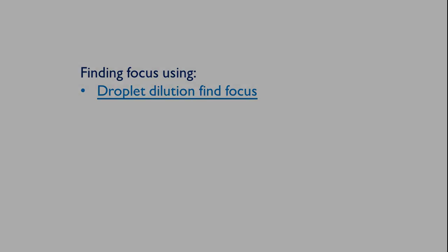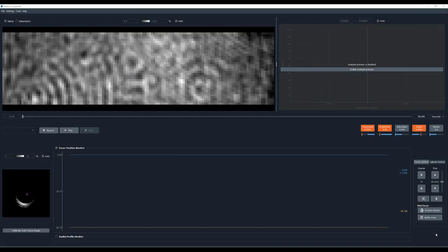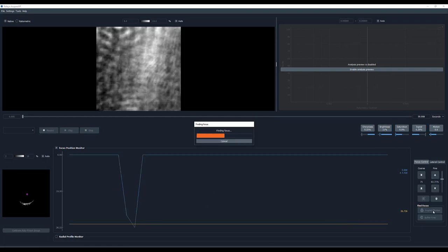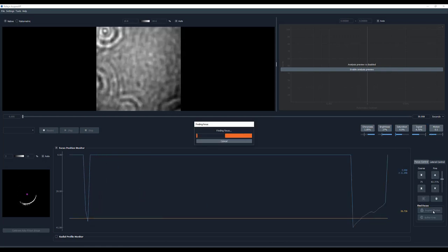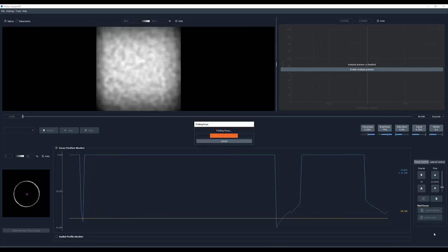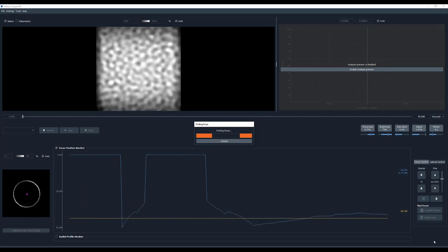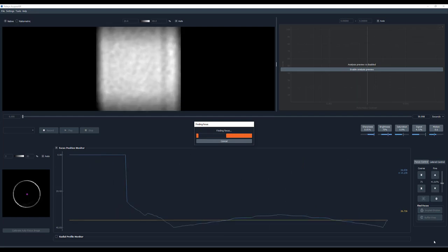To use the Droplet Dilution Fine Focus, make sure to have the lid closed and buffer in the well. When clicking on the Droplet Dilution Fine Focus option, the application will automatically look for the sharpest image of the glass water interface.